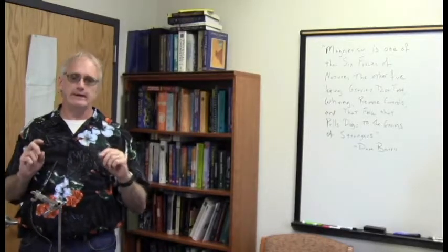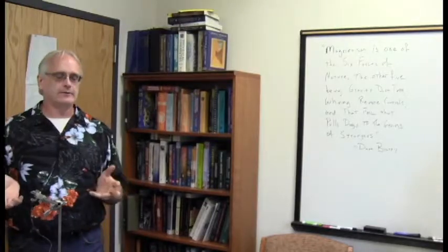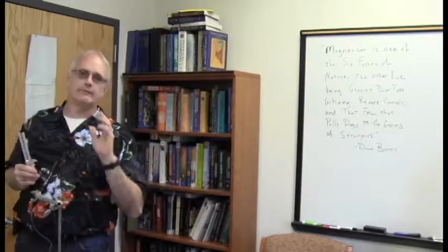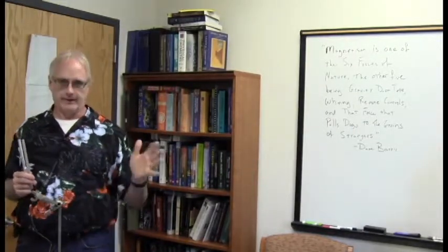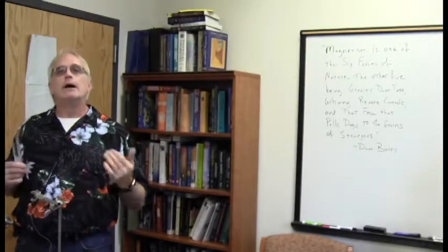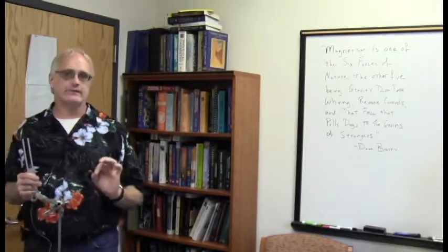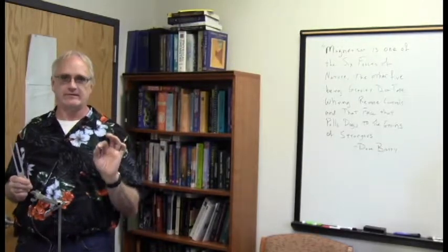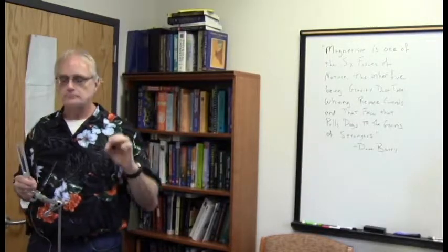So let me show you again, using my friend the microphone here and the software, a little bit about how this works. So once again, the tuning fork. Now this time around I'm going to sound it and hold it up to the microphone so it can pick up the time domain function, listen to the oscillations over time. But what I'm going to ask it to do now is to then apply a Fourier transform. And what it will do is come back with, here is the frequency that that sound wave was built from. So here we go.